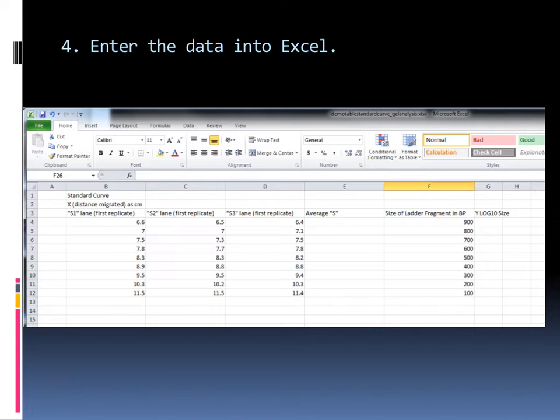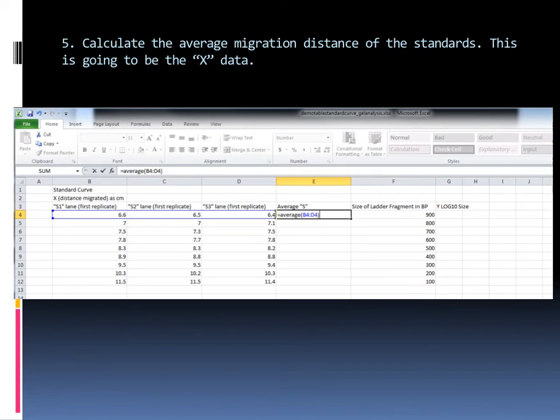Now you enter that data into Excel. So in Excel, I have a column set up for each of the standard lanes, one, two, and three. And I've entered the distance in centimeters. So the one that we were just looking at is all measured and input here. And then I repeated that process for S2 and S3. Now I'm going to determine the average of these in this column. The formula for determining the average in Excel is as typed here in this cell. You would simply then hit return, and it would take the average of this data. In Excel, if you use the cursor to grab the bottom right portion of the cell and drag down, it'll automatically populate these fields. And you'll have a complete data set without having to type things in over and over again.